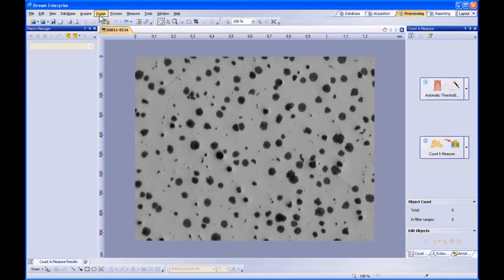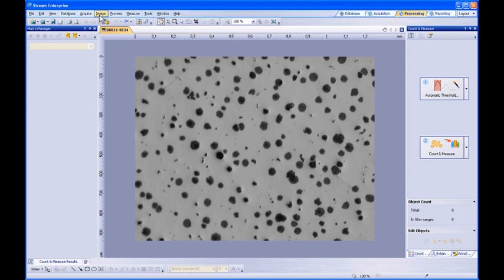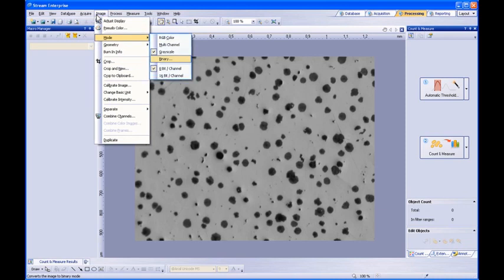The first step of this macro is to binarize our image. In other words, convert it into either black or white. An image can be binarized from the menu Image, Mode, and choosing Binary.